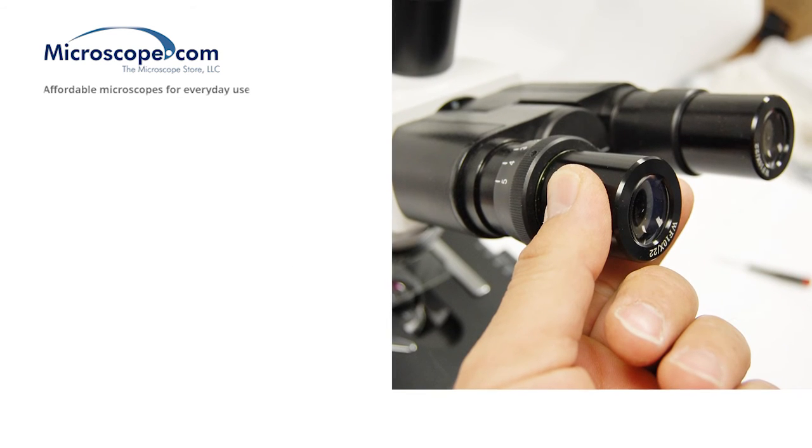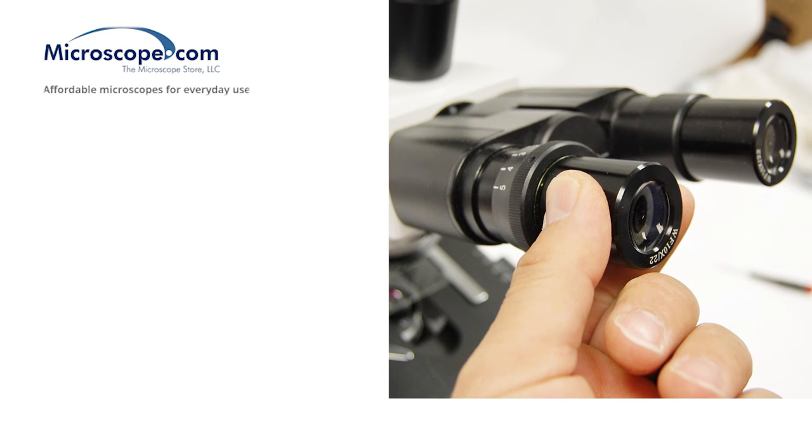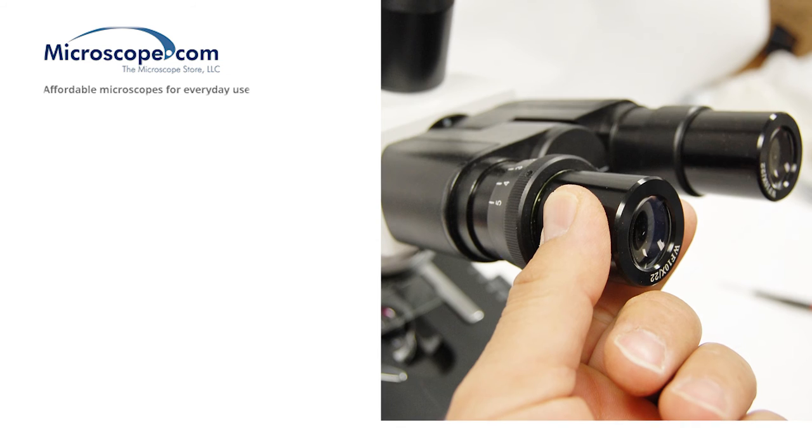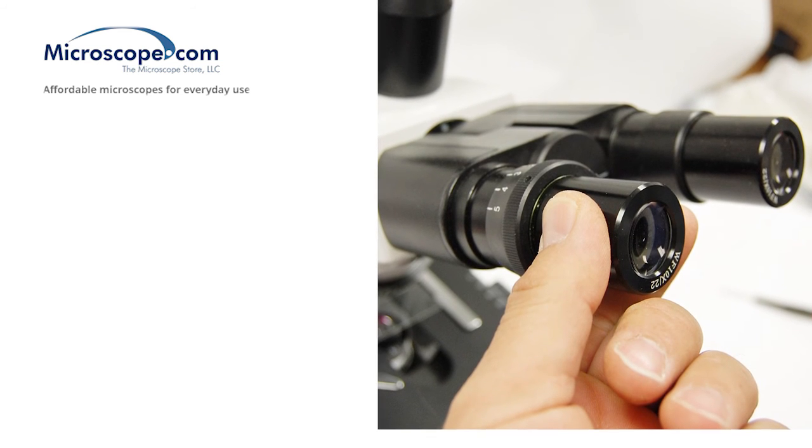In some cases, the microscope may have a larger diameter eyepiece ocular mount, which requires the use of an adapter collar to mount the camera in the opening. Installation is very similar to the previous method.